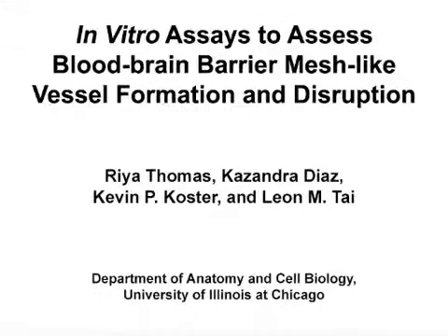The goals of this assay are to dissect the role of disease-relevant processes in blood-brain barrier coverage disruption, identify the underlying mechanisms, and test potential treatments in vitro. This method can answer key basic and applied research questions in the blood-brain barrier and neurodegeneration fields.